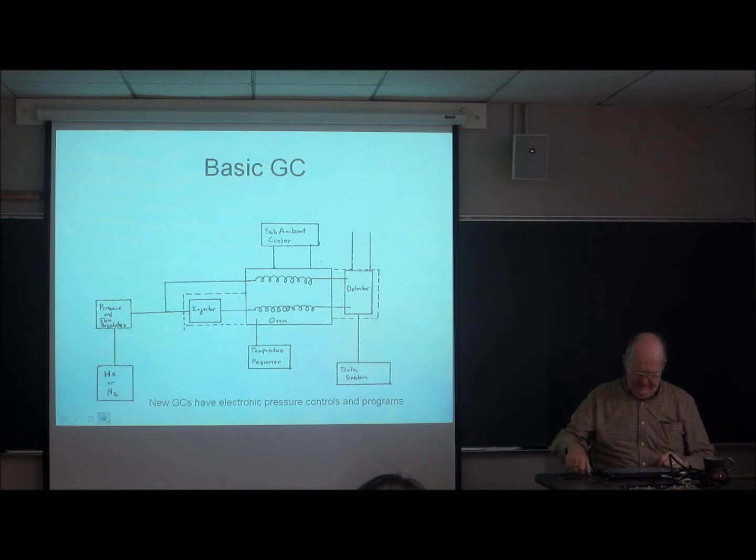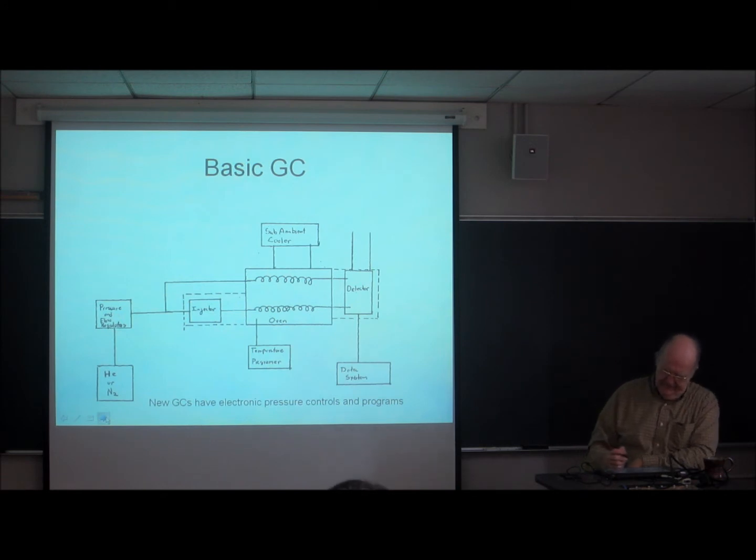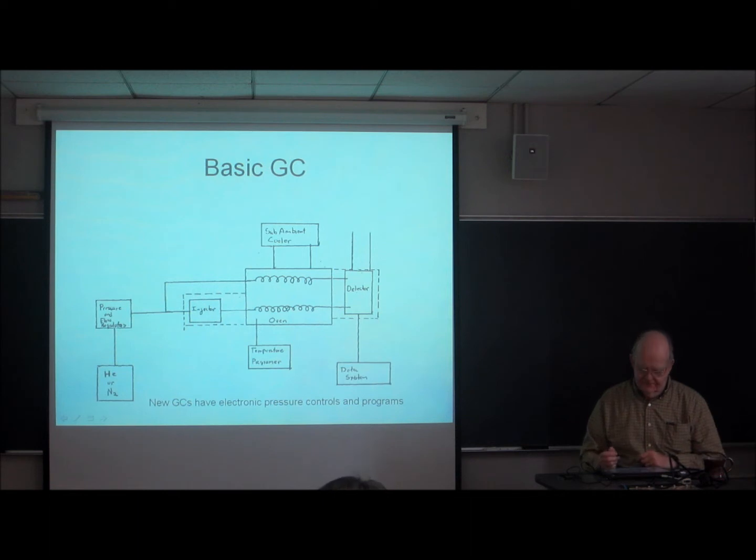So, you've got to put this column in an instrument to make it work. And GCs are basically pretty simple. Of course, the heart of the thing is a column. Showing here a dual column system with dual detectors.